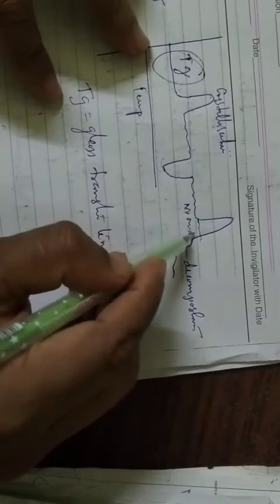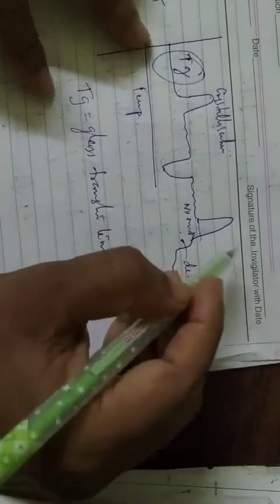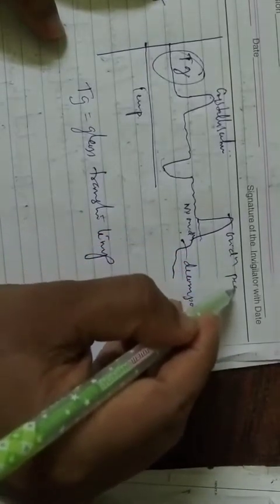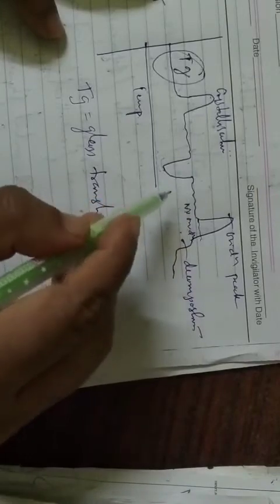You can see in this case that there is no oxidation taking place here, but this is your oxidation peak, and here again no oxidation. So like this you are going to get reduction and oxidation peaks. This part we can take as endothermic, downward, and here as exothermic. So this is endothermic and these are exothermic. This is oxidation and this is a reduction type of peak.